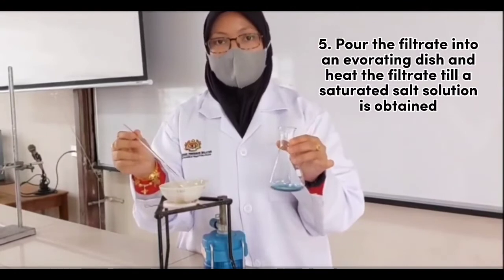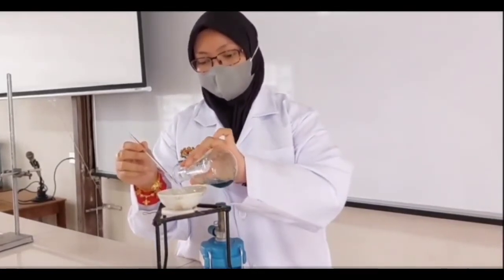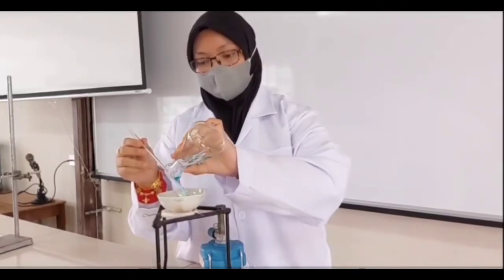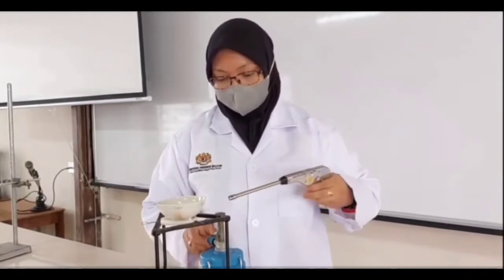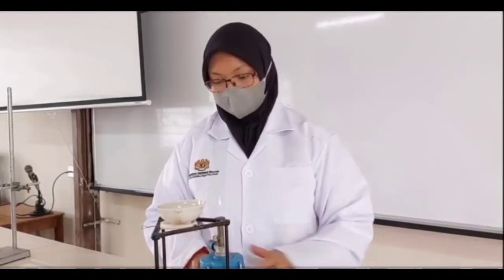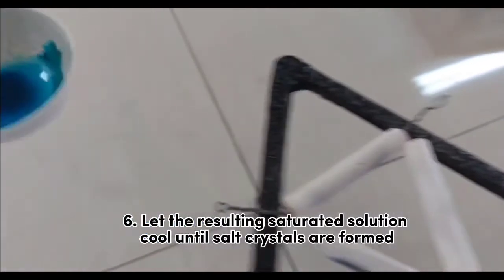Pour the filtrate into an evaporating dish and heat the filtrate till a saturated salt solution is obtained. Step 6. Let the resulting saturated solution cool until salt crystals are formed.